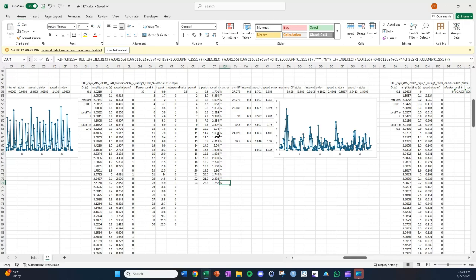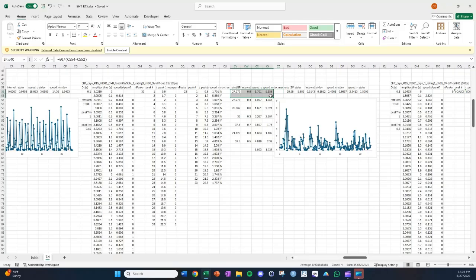And one thing that you might notice, which is rather interesting, is the amount of time between the contraction and relaxation. So we'll see if that makes sense. So this interval here, we'll see if that makes sense. And one of the ways I like to check whether this makes sense is looking at the value before the treatment. So before the treatment for this condition, I'll go over here.